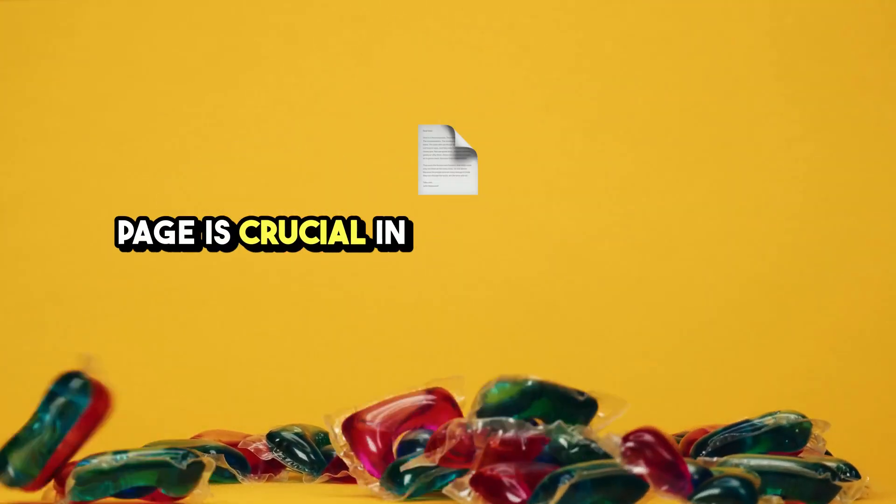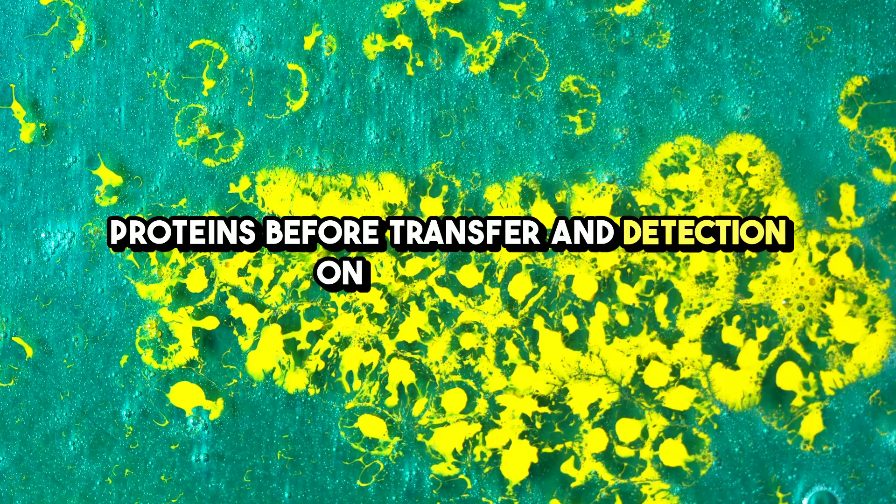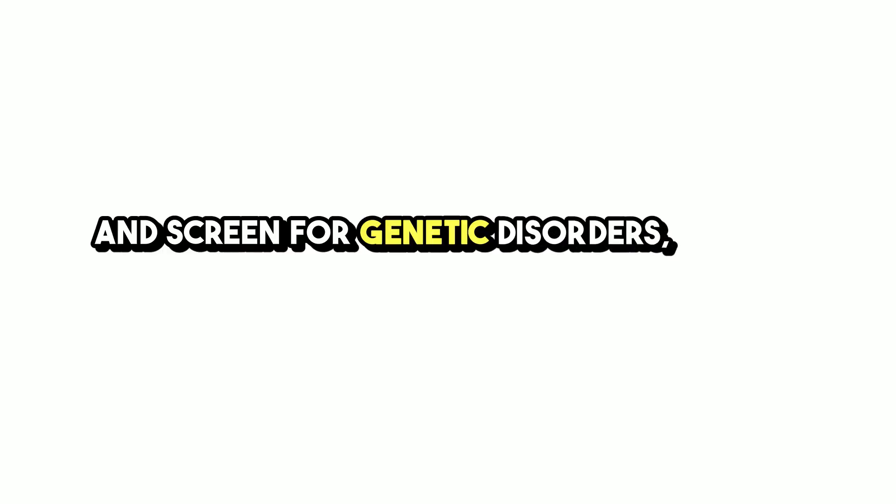PAGE is crucial in Western blotting for separating proteins before transfer and detection on a membrane. PAGE is also used to detect disease markers and screen for genetic disorders, making it a valuable tool in diagnostics.